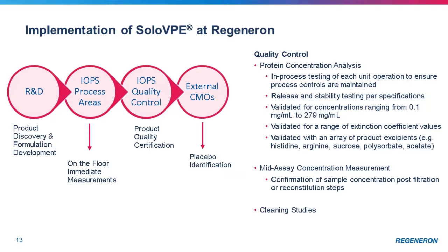We have also been able to validate this method for a range of extinction coefficients and an array of product excipients. In addition to testing for product quality, we have implemented SoloVPE for mid-assay concentration measurements.